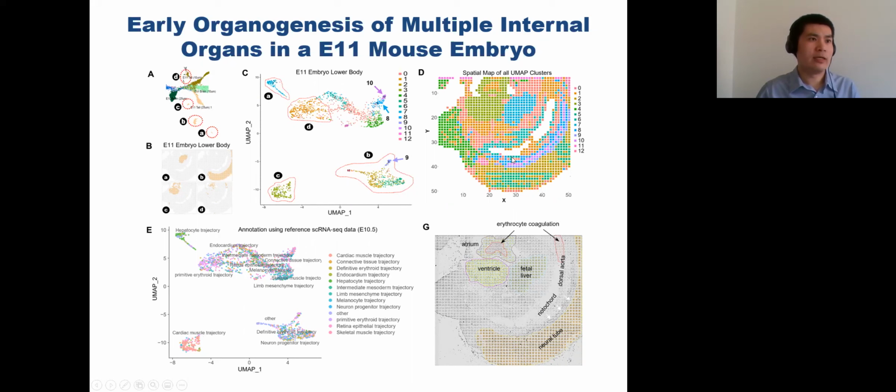And also we can see a very thin layer of distinct patterns here. That turns out to be some skeletal muscle cells around here. And you can also see a thin layer of cells around this region, which turns out to be the aorta, the endothelial cells of the aorta in the body.